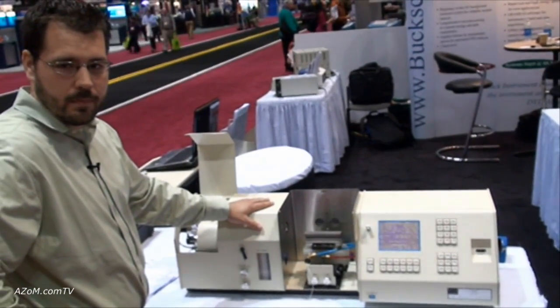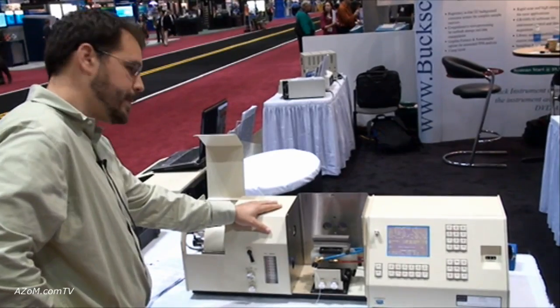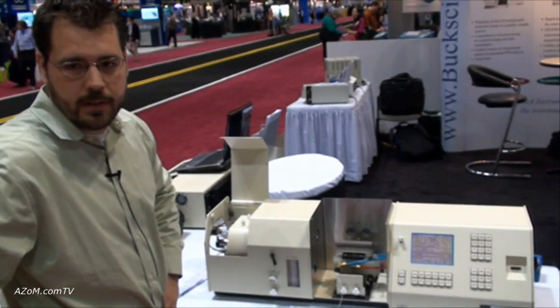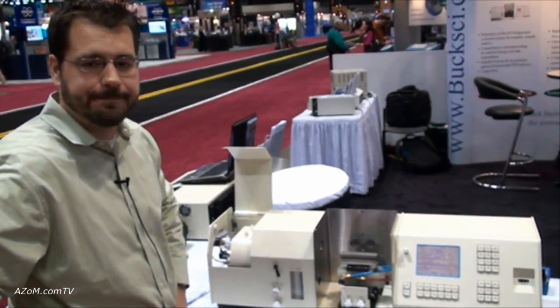And for anybody who's looking to buy one, you guys also offer flexible purchasing terms? Yes, we do offer leasing terms if needed through our sister company, Big Buck Financial. Thanks very much for giving us a tour through the 210 atomic absorption spectrometer. Thank you.